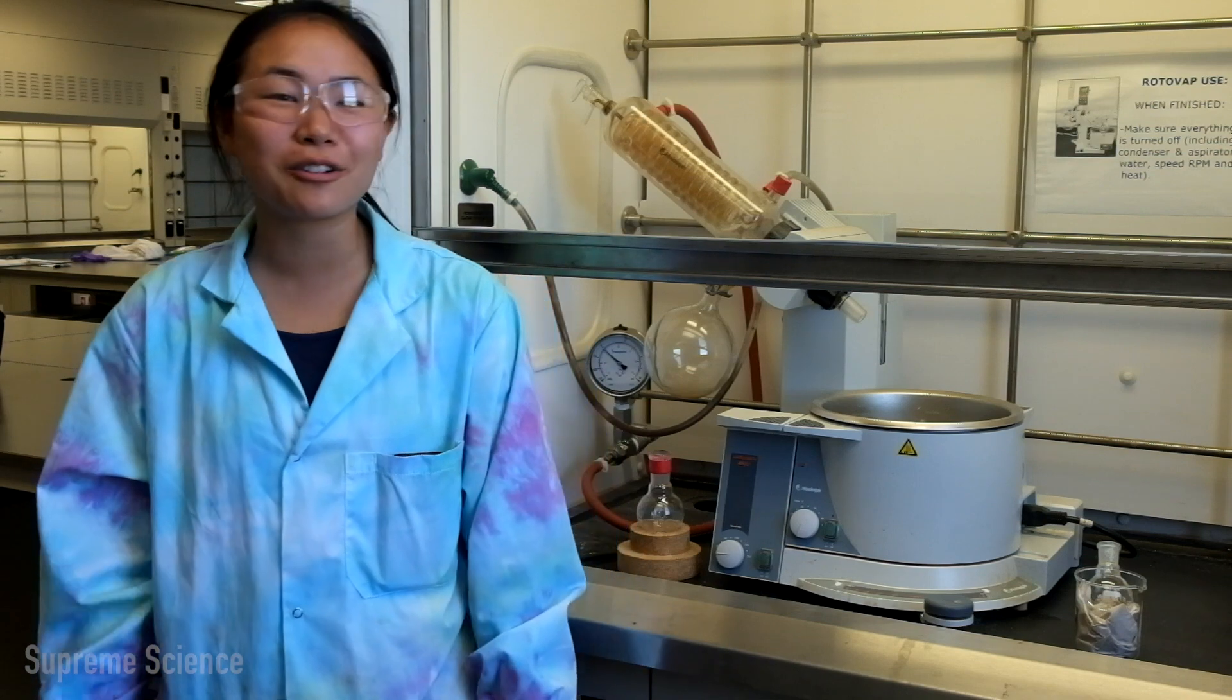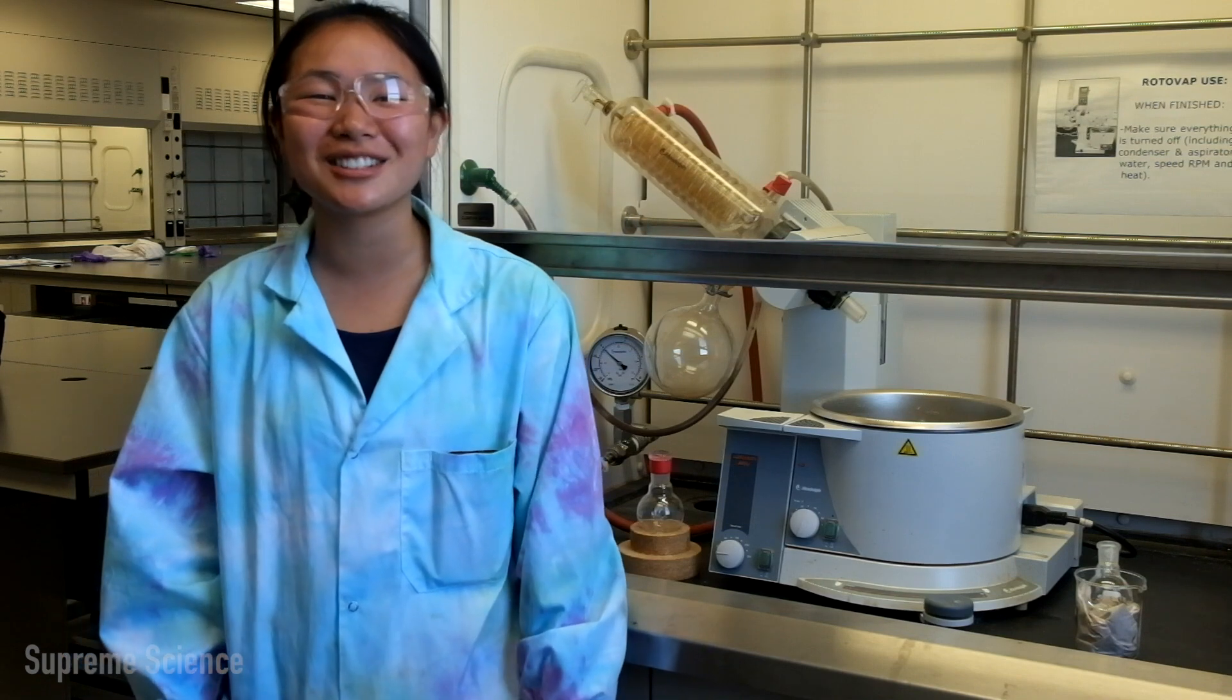So today we're going to talk about the Rotary Evaporator, also known as the Rotovap. It's generally used to obtain your product by removing the solvent. It does this by reducing the pressure inside your round bottom flask, but it also increases the surface area through rotation. And you can also heat your solvent.